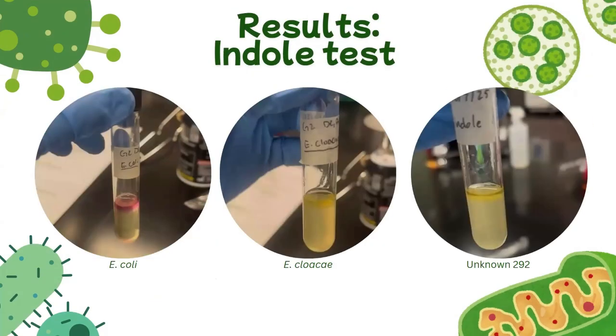Here are the results for the indole test. Our E. coli, you can see it turned a pink color, meaning it is a positive. The E. cloacae did not change. It stayed a kind of clear-ish color on the top. And then for our unknown 292, it was the same as the E. cloacae. The E. coli has that red ring at the top because it is a positive, meaning it produces indole from tryptophan. The no color change means the E. cloacae is a negative, and from what is seen from our results, the unknown 292 is also a negative.